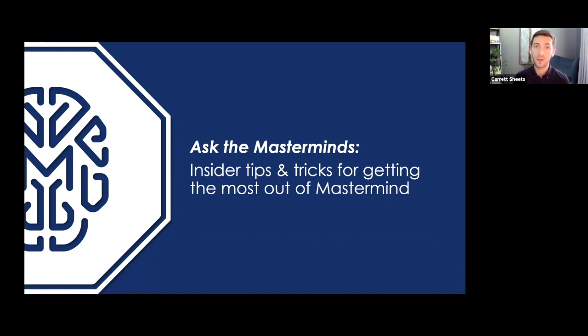In today's webinar, an expert curator and an experienced variant scientist will guide you through how they use the Mastermind Genomic Search Engine to rapidly classify variants with all relevant evidence. Driven by common questions from users, they will highlight helpful tips and tricks for navigating the medical literature so that you get the most out of your data.